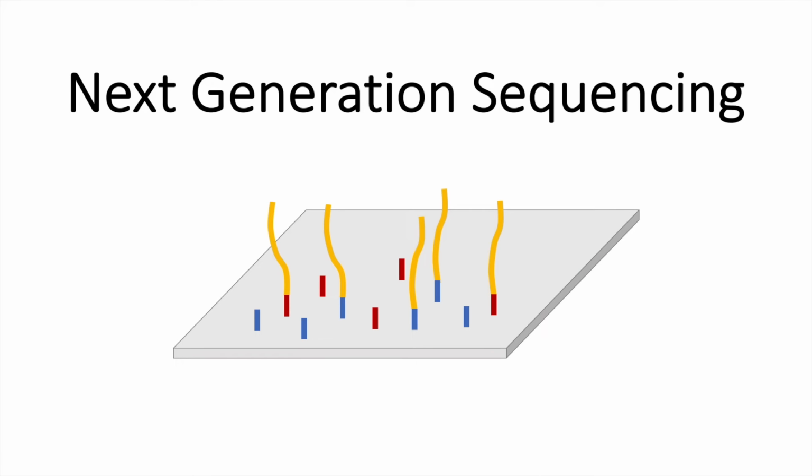Hello and welcome to today's talk about next generation sequencing, which is also known as massively parallel or just deep sequencing. Next generation sequencing has completely revolutionized genome analysis. With next gen sequencing, it is possible to sequence an entire human genome in just one day.